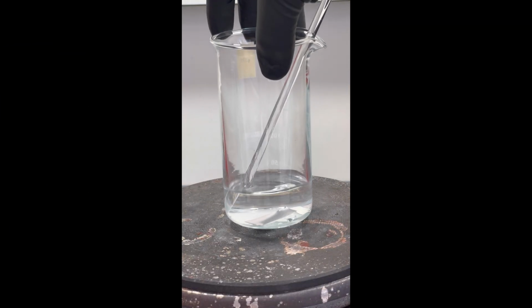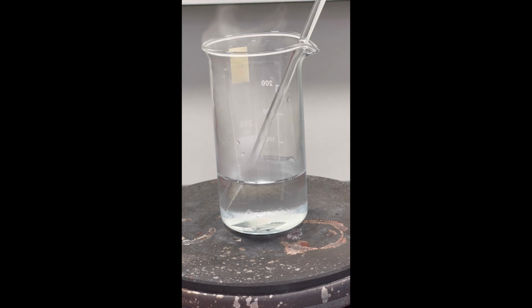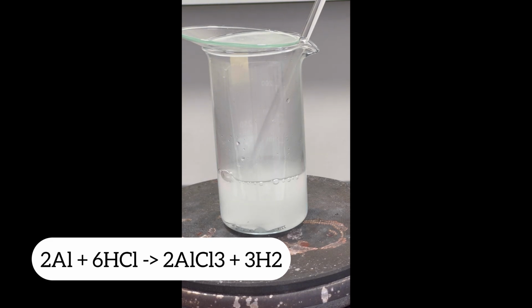The metal is then transferred to a beaker with some distilled water and placed on a hot plate. 20 to 30 milliliters of concentrated hydrochloric acid are added, and the beaker is covered with a watch glass. With heating, the aluminium starts to dissolve, liberating hydrogen gas. As the reaction proceeds, the solution becomes opaque and darkens in color.